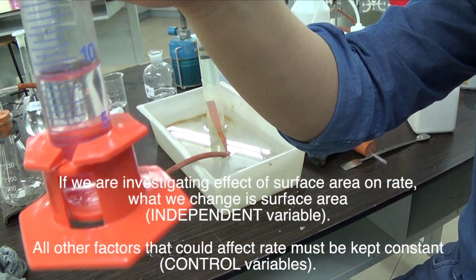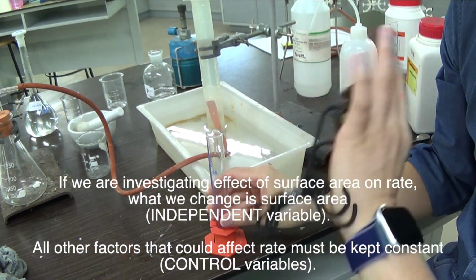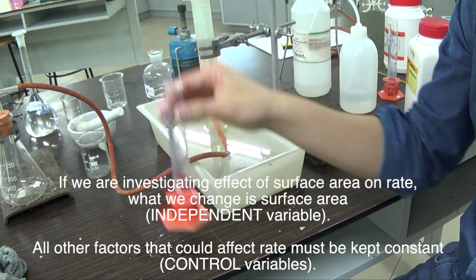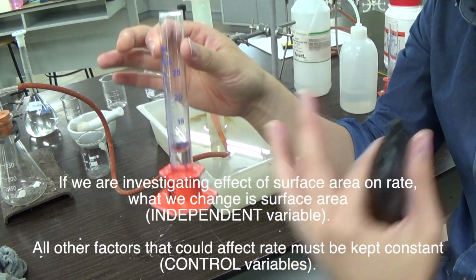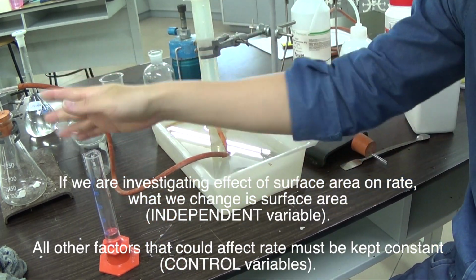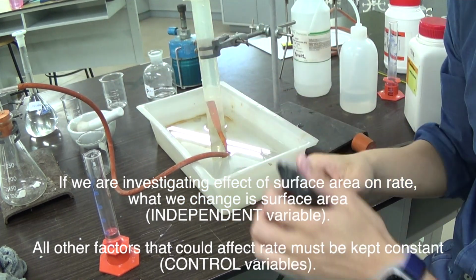Okay, so I will start timing only after I add in the acid. I need to make sure that I use the same volume of acid for both my experiments. Every other factor must be kept constant: temperature, volume of the acid, concentration of the acid, what else? The mass of the solid. Everything else must be kept constant except for the surface area of the solid.